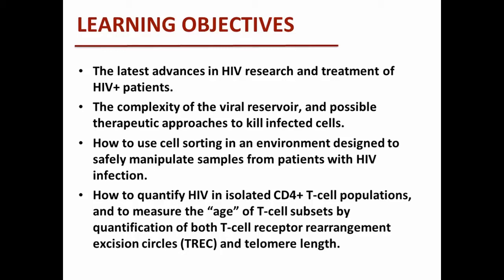Actually, all human samples are at risk of an infection, so I will show you how you can put very important and big instruments under a cabinet to work safely with the blood or lymphocytes from patients, for human beings actually.